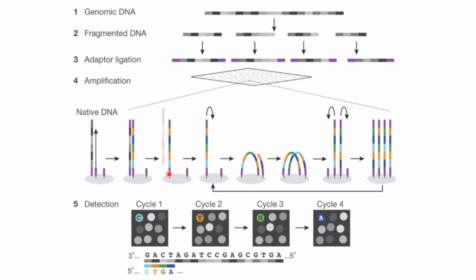This is an insert that is generated in a particular direction, say from the 5' to 3' end of the fragmented DNA. Say that is a particular read. We call this a forward read. In the other case, when it bends down to bind to the other complementary adapter sequence, another read is formed from the opposite direction, that is from 3' to 5'. This is called a reverse read.